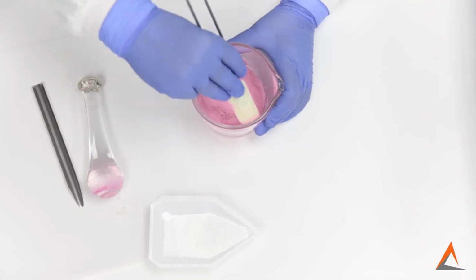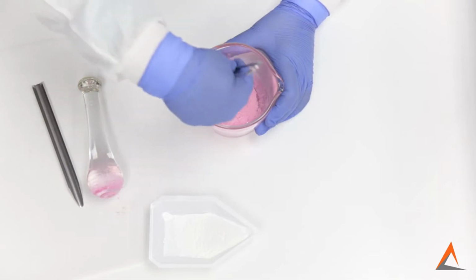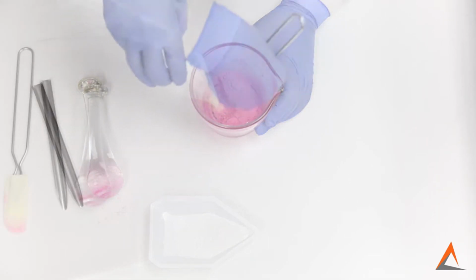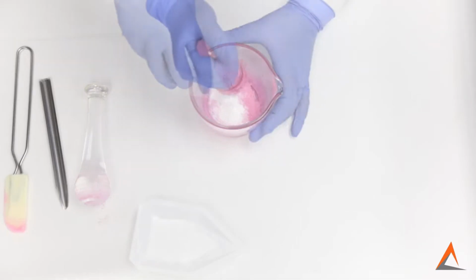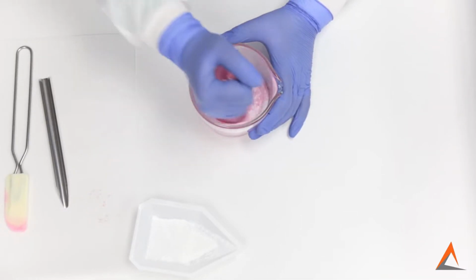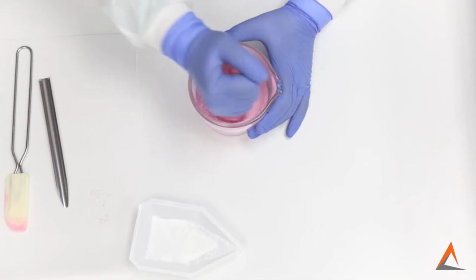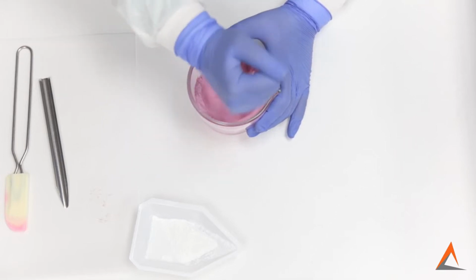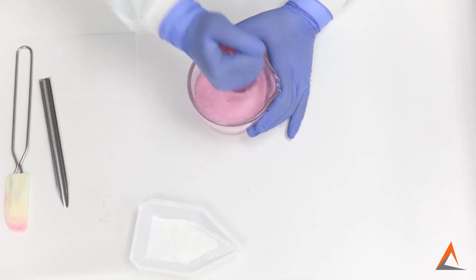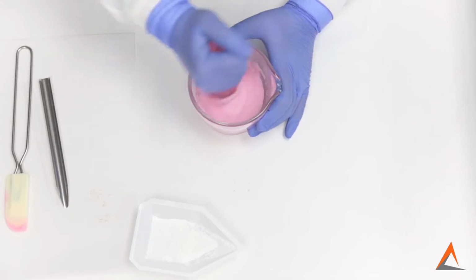As you see, we're really getting a nice, fainter pink color throughout the mix. Let's eyeball an approximately equal quantity of lactose and triturate. Always remember to be very careful not to use any metal spatulas in your glass mortars. These can etch the sides of your mortar, and we want to avoid this as powders can get stuck in these scratches.